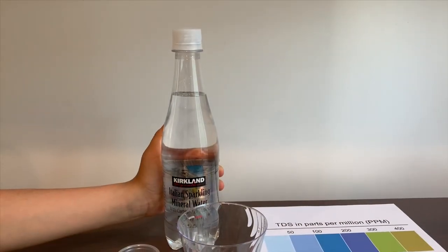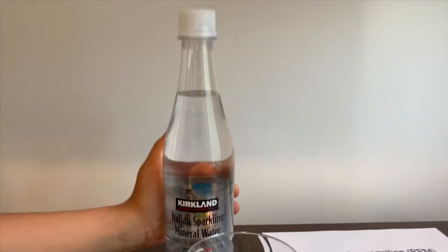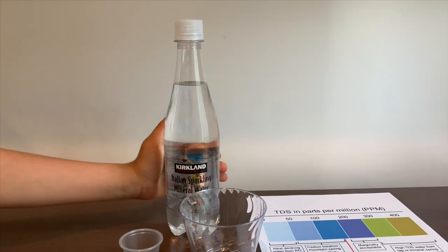This is Kirkland Italian sparkling mineral water. It's sold at Costco in a box of 24. It's sourced from Italy. Let's test the pH and TDS levels.